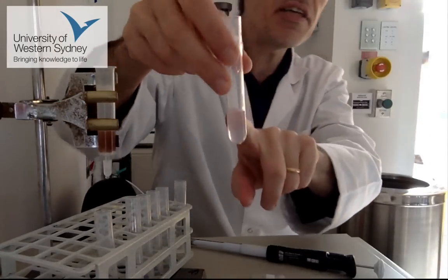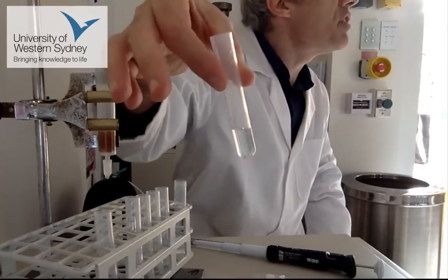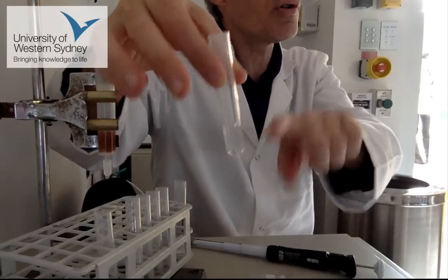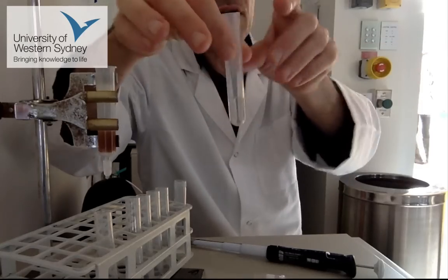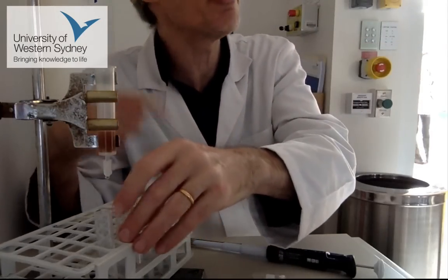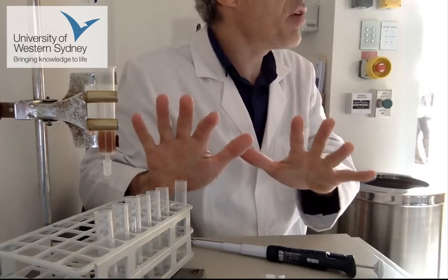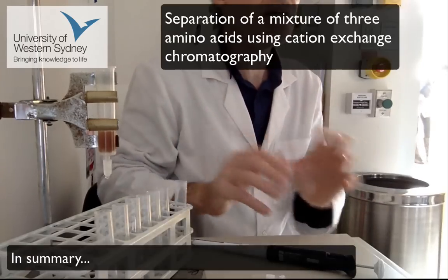And then to each of these samples, you'll do that ninhydrin test to establish whether there's an amino acid in that sample or not. And you should get a peak of a particular tube or two where your sample collects. All right. So it's a very rough demonstration, but hopefully it helps you do that part of the experiment.